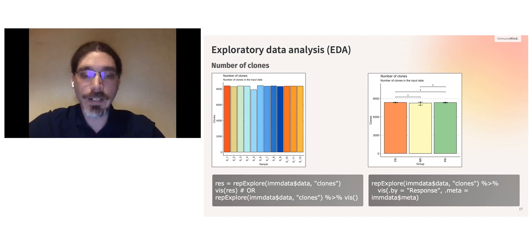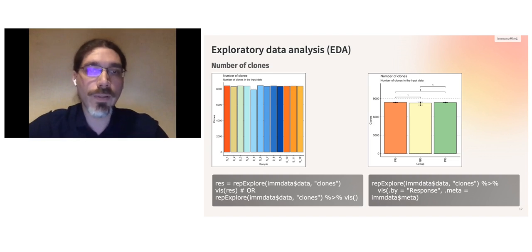And on the other side, you can see an example of Immunarch's built-in grouping ability. If you have specific characteristics you would like to group by, such as immunotherapy response. So if you have samples with immunotherapy response and without it, or in this case, you have 3 different groups of patients: with full response, it's the orange one, with partial response, it's the green one, and the group with no response, it's the yellow one.